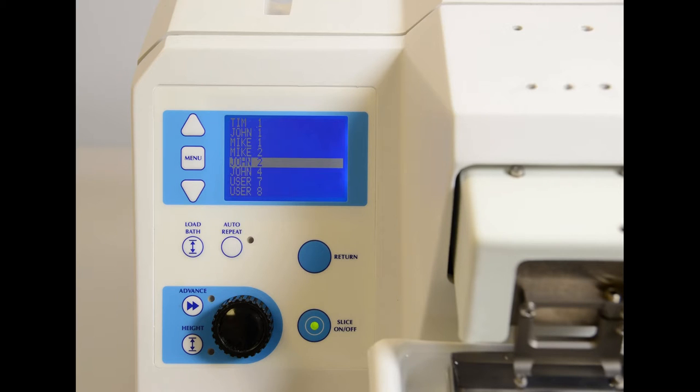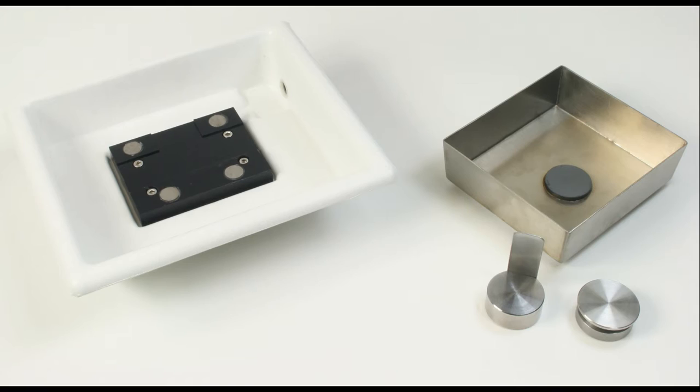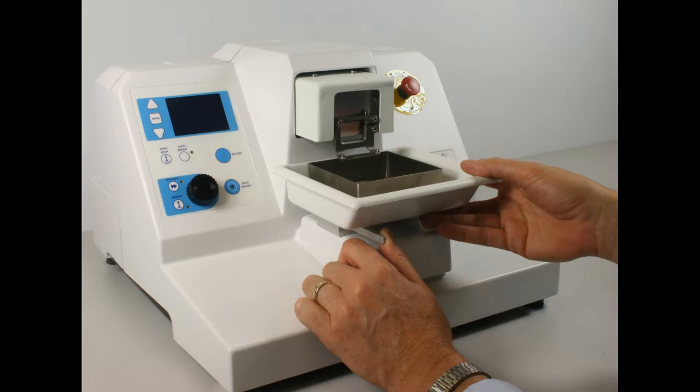The slicer weighs approximately 33 kilograms. You may wonder why the instrument needs to be heavy. There are good reasons. The structure of the slicer must be very strong and rigid to maintain the accuracies we have achieved, and the ratio of the stationary mass to the vibrating blade mass has a significant effect not only on slice quality but on transmitted vibrations and operator comfort as well. The greater the ratio of stationary mass to vibrating mass, the better the quality and comfort with fewer vibrations transmitted through the instrument to the workbench. To maximize this ratio we also have to ensure that the vibrating mass is as small as possible.